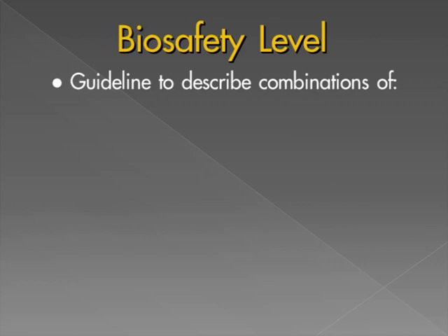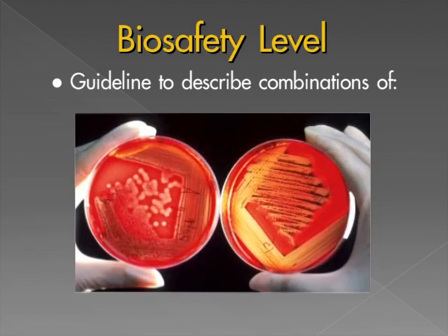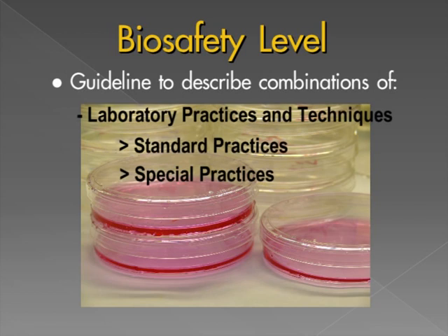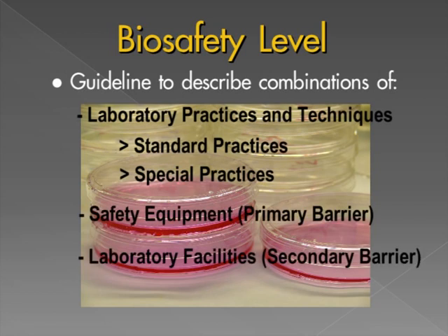The term biosafety level refers to the level of the biocontainment precautions required to contain dangerous biological agents. The different biosafety levels developed for microbiological and biomedical laboratories provide increased levels of personnel and environmental protection. The guidelines for each biosafety level work from the premise that safe work sites result from a combination of laboratory practices, techniques, safety equipment, and proper laboratory facilities.